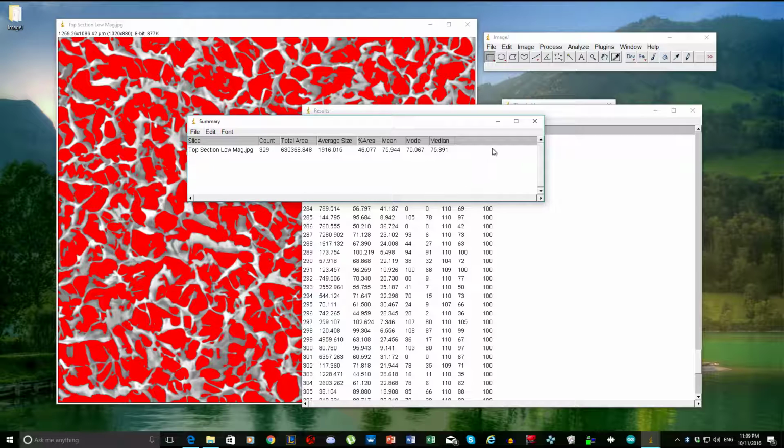This whole thing, you might want to take a picture of it or a screenshot and use it in the lab report, because I think you have to show the analysis of the whole image, and this specific part here is what she needs. And you have more data if you want to talk more about it or give it specific specifications.